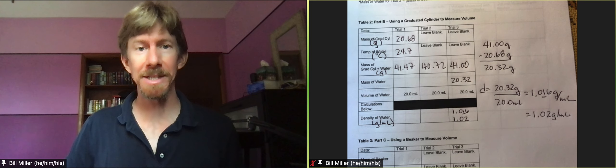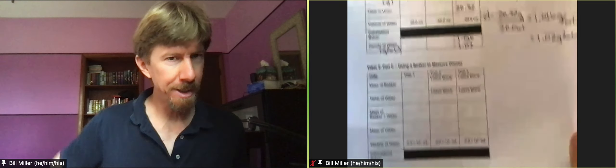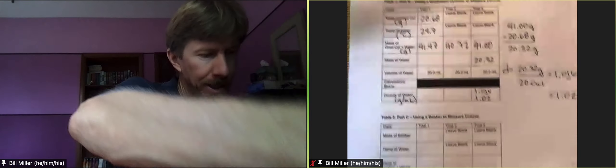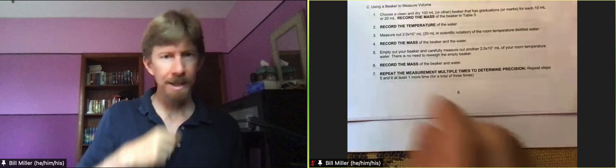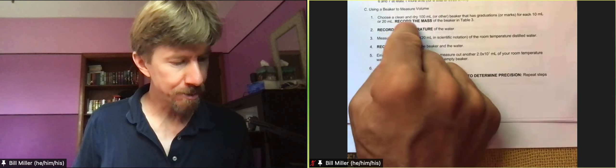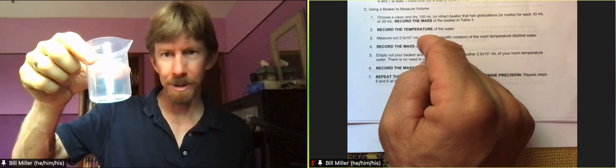This is going to be Experiment 1 Basic Techniques, table number 3. And for table number 3, we're going to use a beaker to measure volume. It says choose a clean, dry 100 milliliter or other beaker, and I'm going to choose my 100 milliliter beaker.